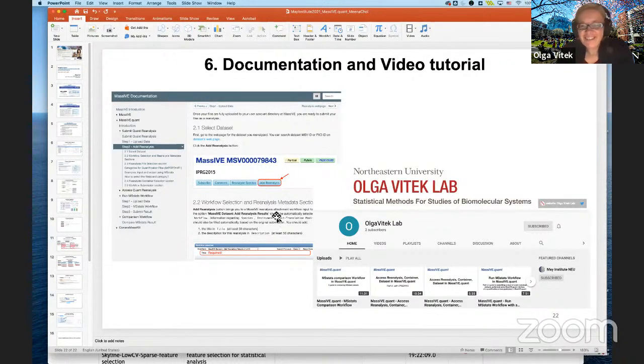Thank you so much, Meena, and thank you to everyone who stayed all the way through the end. I think this is a really important contribution to be able to document all the analysis, not just related to the identification of spectra, but all the way through statistical analysis of quantitative data, and to do this in a way that is not specific to a particular tool for data processing or particular statistical analysis software package. So even if you are a method developer and develop your own statistical methods or data processing methods, this is a repository for you. And if you are working more on the biology or clinical side, and you're interested in documenting your work or just looking at the results of the analysis of similar data sets, we also hope that this will be useful for you.